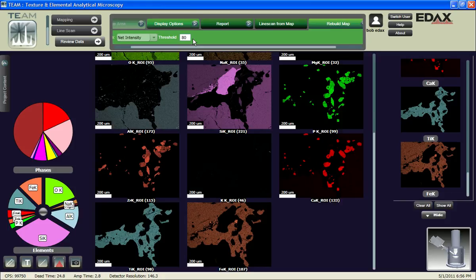So if it doesn't have at least 80 counts at the highest channel in our spectrum, it's not going to bother even trying to do the background. It's going to assume the background is 0. And so if we make this number something quite high, like say 200 would be relatively high, then we'll probably never calculate a background, and we'll assume it's 0 everywhere.